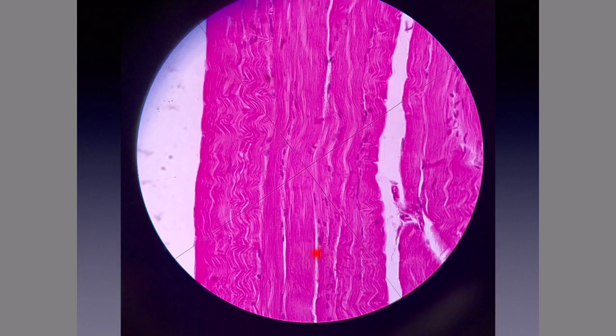And this, as you can see, a nice striated pattern here, long and relatively thin fibers with multiple nuclei, classic for skeletal muscle, and that's what this was.